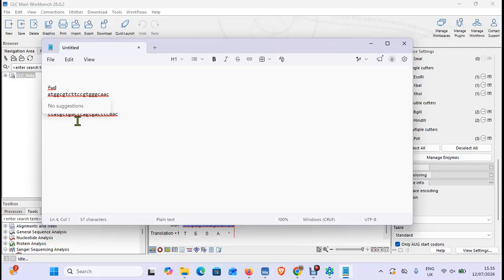It has to be restriction site plus 3. So I go AAA, just the way I roll, and then GGATCC, that's your BamHI restriction site. So that will mean that your PCR product, when the polymerase comes screaming back the other way after the first round of PCR, has this added on to the end of the product, just as the first round has that tail flapping in the breeze.